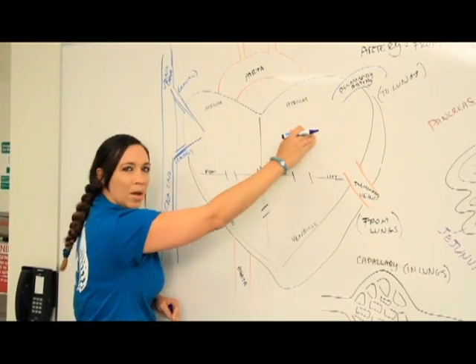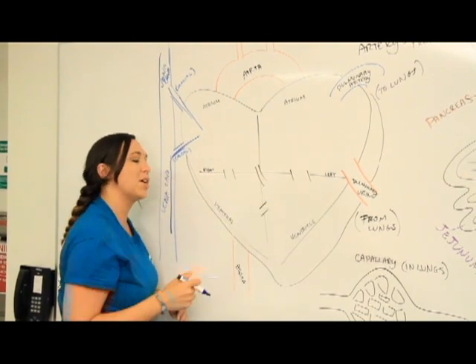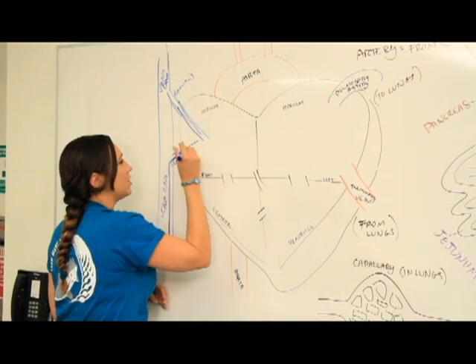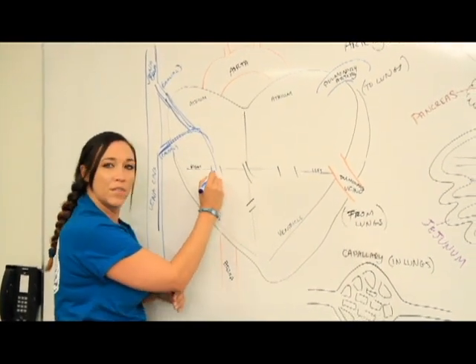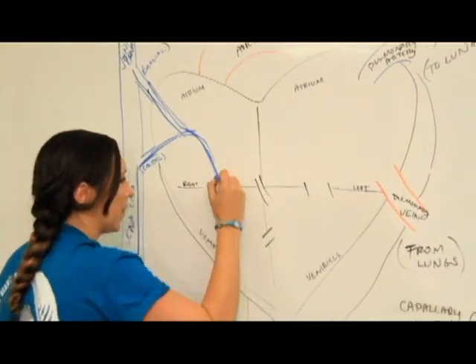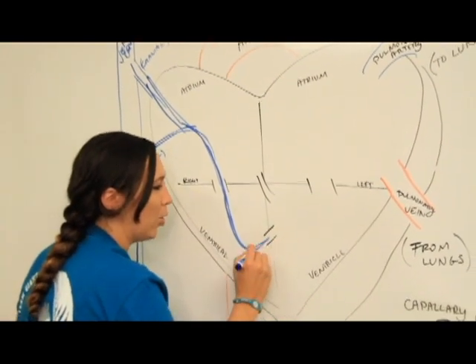Atriums are the top portion of the heart, ventricles are the bottom, because we as humans and pigs also have 4-chambered hearts. So it enters deoxygenated into the right atrium. It travels down the tricuspid valve. This is one of our AV valves, known as the tricuspid valve, into the right ventricle. And then it comes up and out the pulmonary valve.